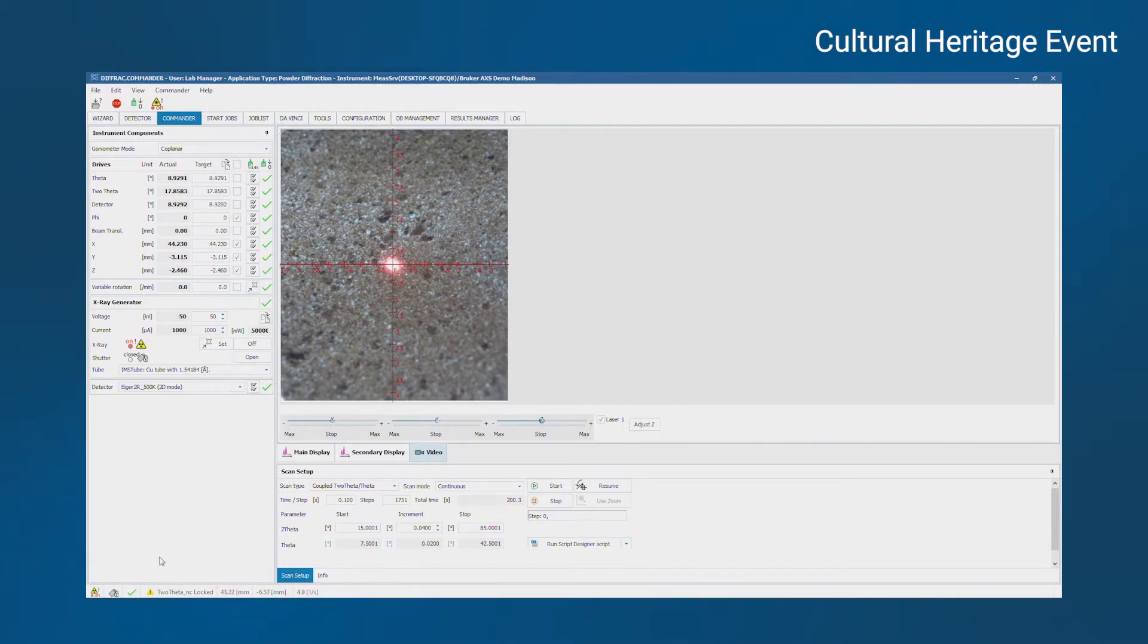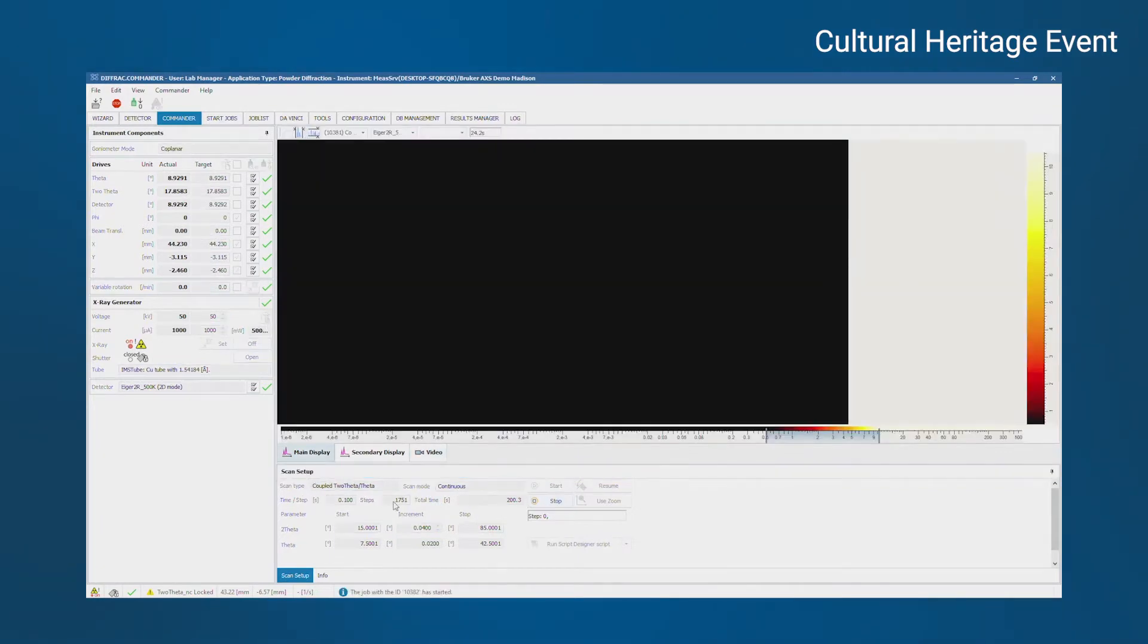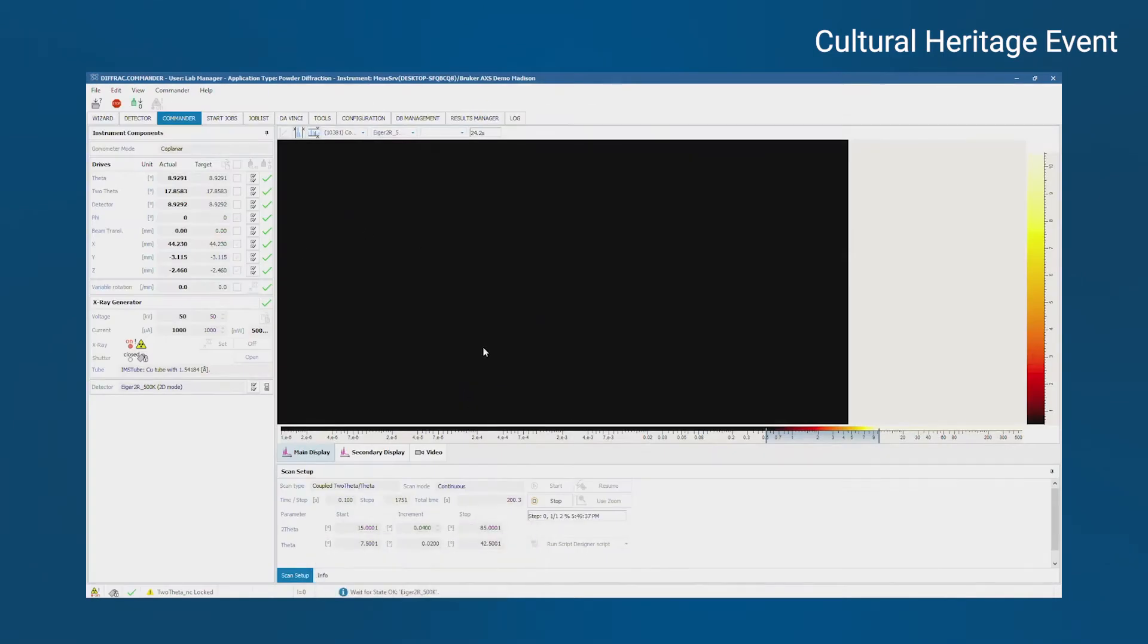So now the sample is aligned. We have the area that we want to measure, so all I have to do is hit start. This is set to a coupled two theta, theta scan, just like more traditional XRD. So start, stop, time per step, same settings.